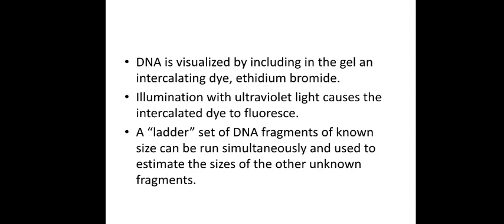Now, the advantage of this is that you can compare the known with the unknown. You have an unknown sample, you have a known sample, you are going to compare the fragment length, the length it has moved. Just like what you have done in chromatography, where you go for the retention.